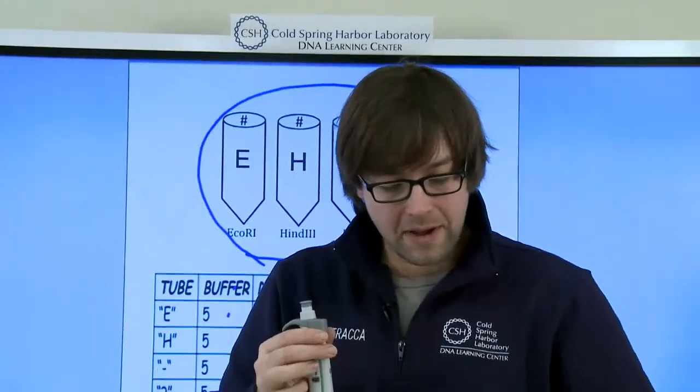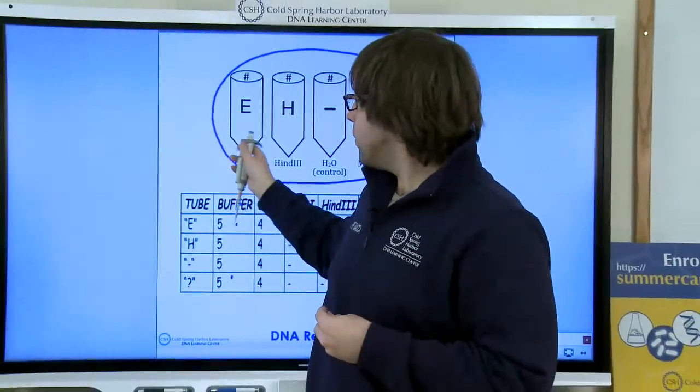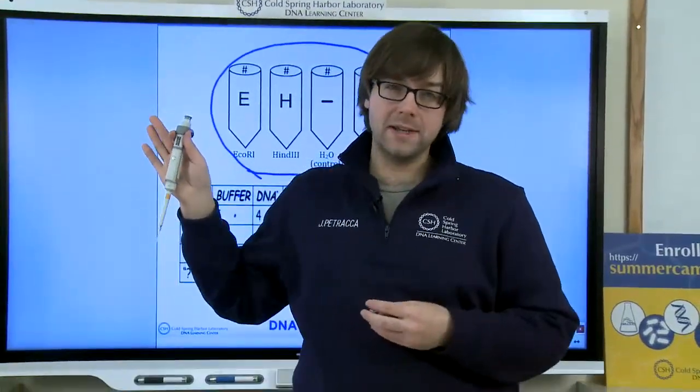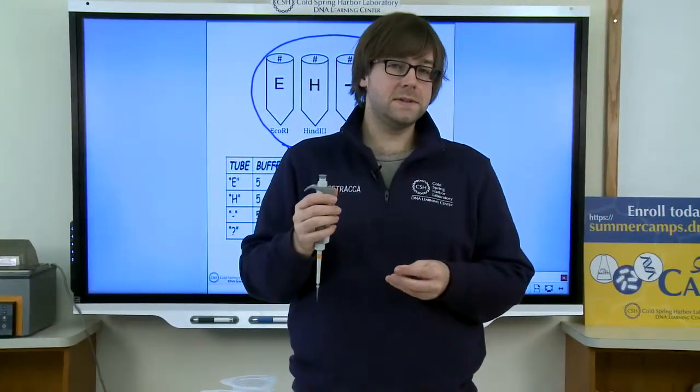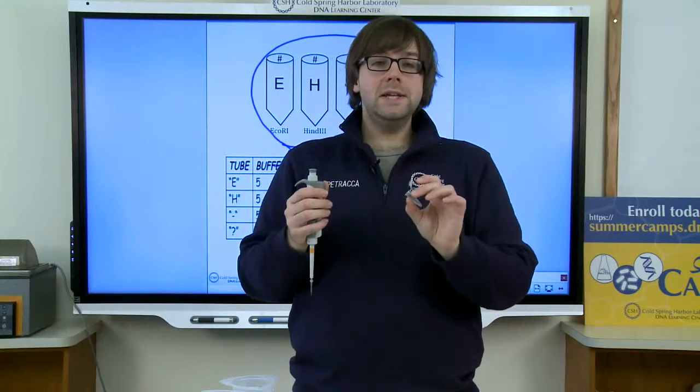Then I'm going to go to my first tube. I'm going to basically go in order. It helps to be organized about this. You don't want to put stuff in random tubes and forget what you added, because then it's not going to work out well for your results. So I'm going to start with my E tube.